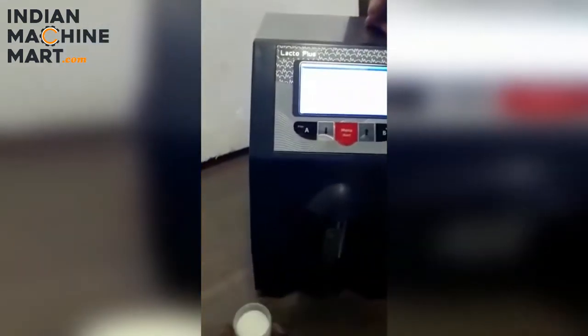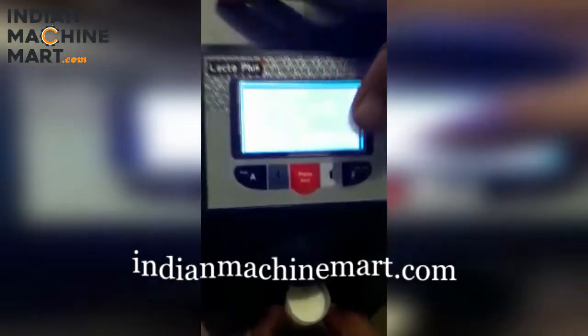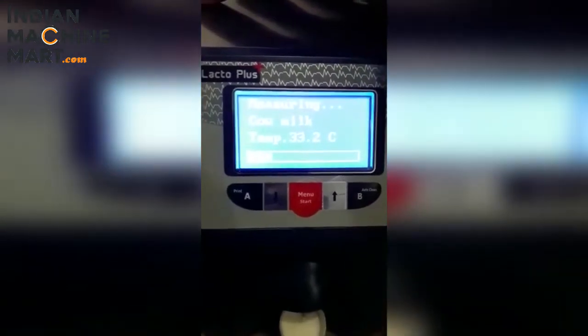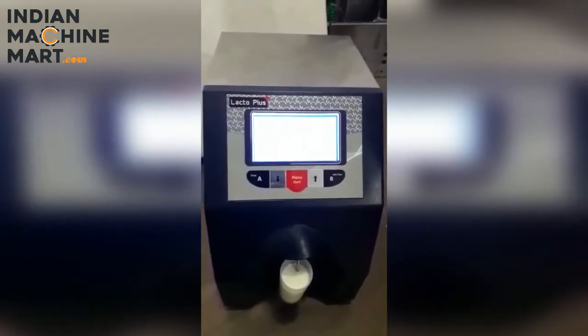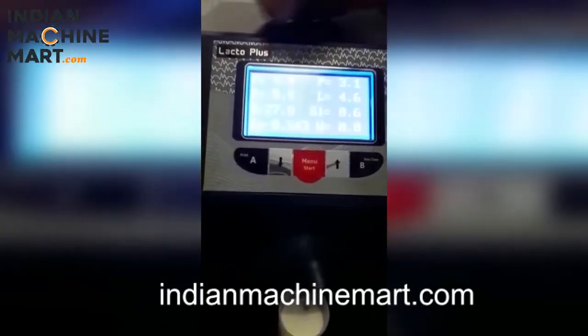Then, if you want to test another sample, you will go back, put in the new sample, press the start menu button, and it will begin the test. The temperature reading will then appear.